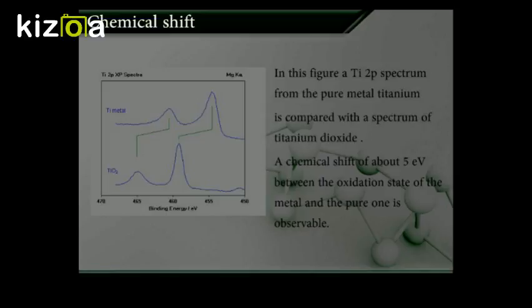So, what you need to take away from today is basically how XPS theoretically works and how to interpret the data of such a spectrum.